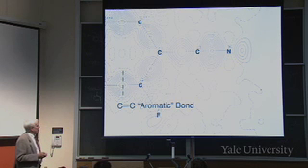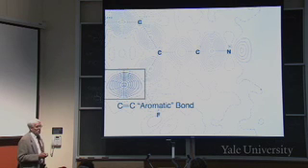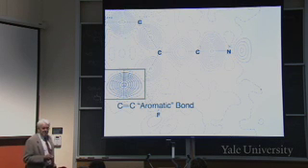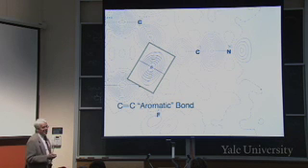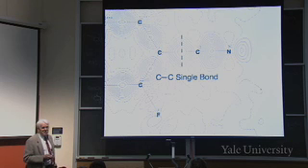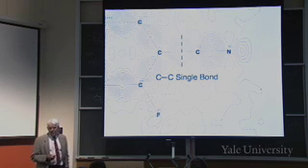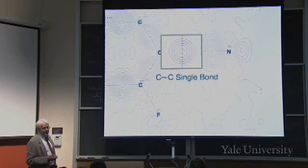This is how the electrons shifted during formation of the bonds. So there's a carbon-carbon aromatic bond, 1.5 bonds, and if you turn it and look at it, it's distorted the way you expect, just as in the previous experiment we talked about. Here's another one, same deal. Now here is a single bond, a carbon-carbon single bond. What's it going to look like in cross-section? Round. Good.